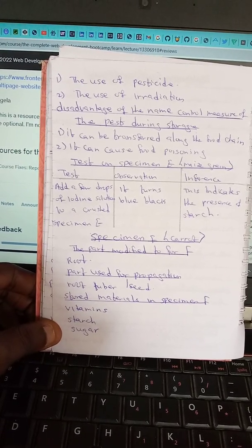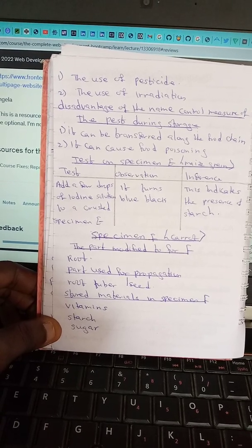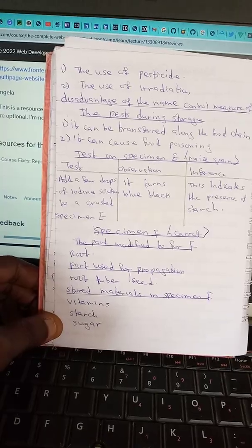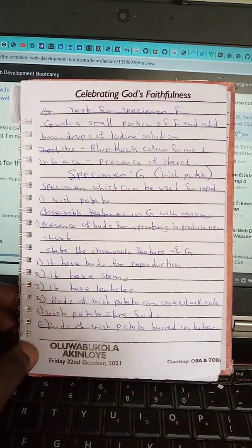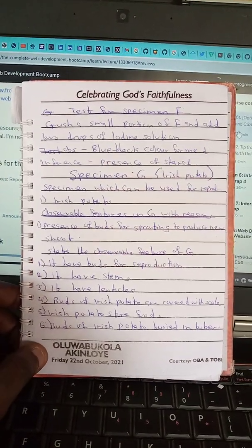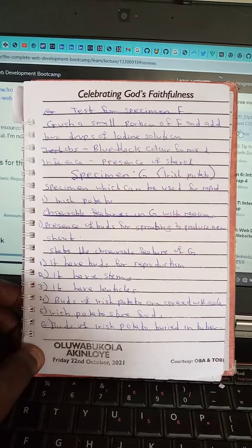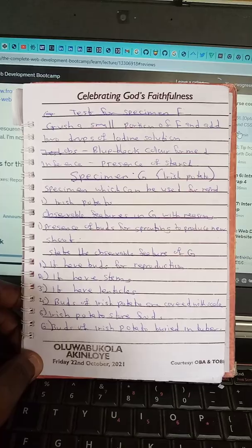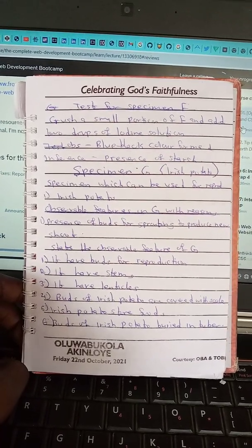Specimen F is carrots. The part modified for F is roots. Parts used for propagation include root tubers and seeds. The stored material in specimen F includes vitamins, starch, and sugar. Test for specimen F: crush a small piece of F and add two drops of iodine solution. Observation: blue-black color forms, indicating the presence of starch.